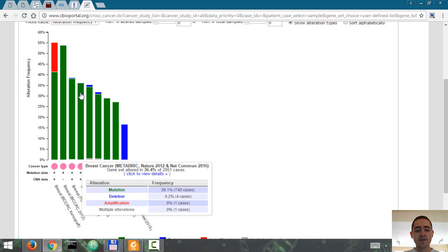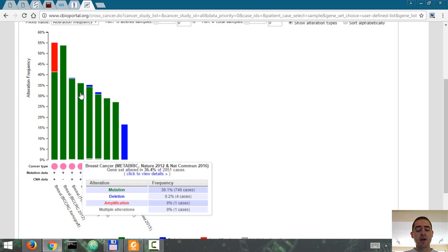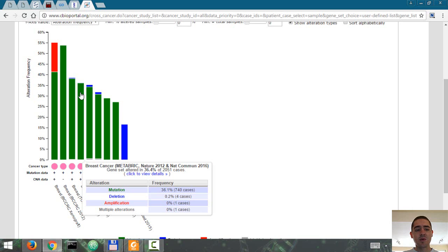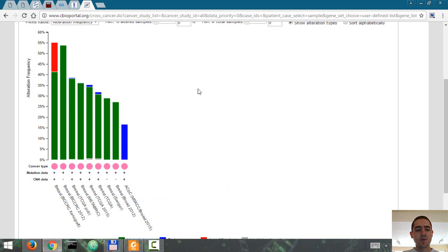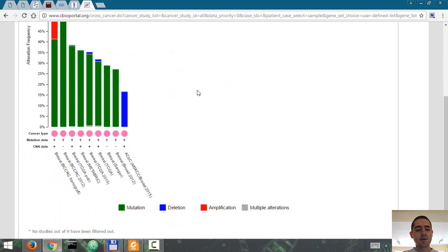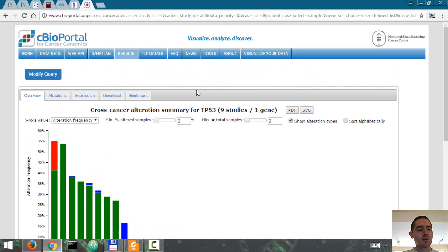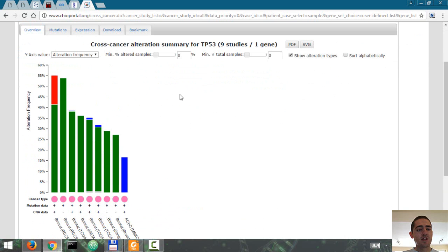And this one is 36% out of 2,051 cases, which is like... TP53 is mutated in 740 samples, which is quite a big frequency.